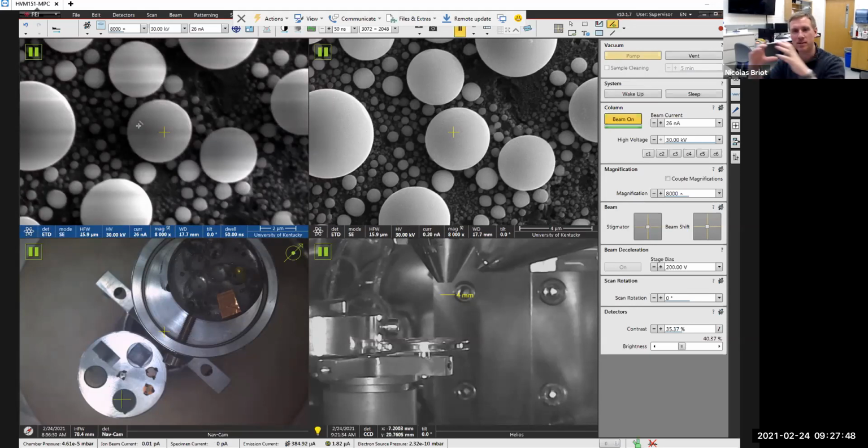Because the spot that is scanning is just bigger, so you cannot distinguish very fine details if, when the electrons land, they just probe several regions at a time, okay? So when you do imaging, you want the low current. So why would you need high current?